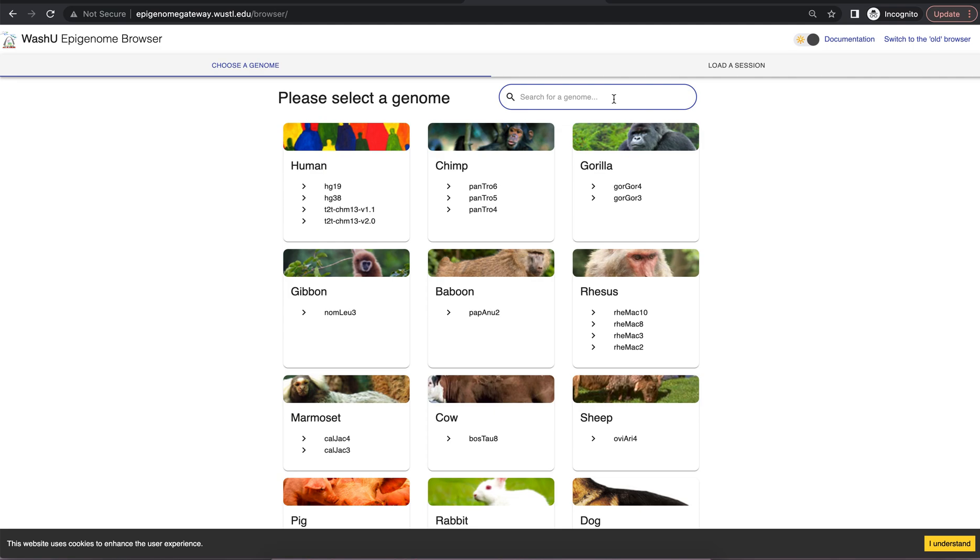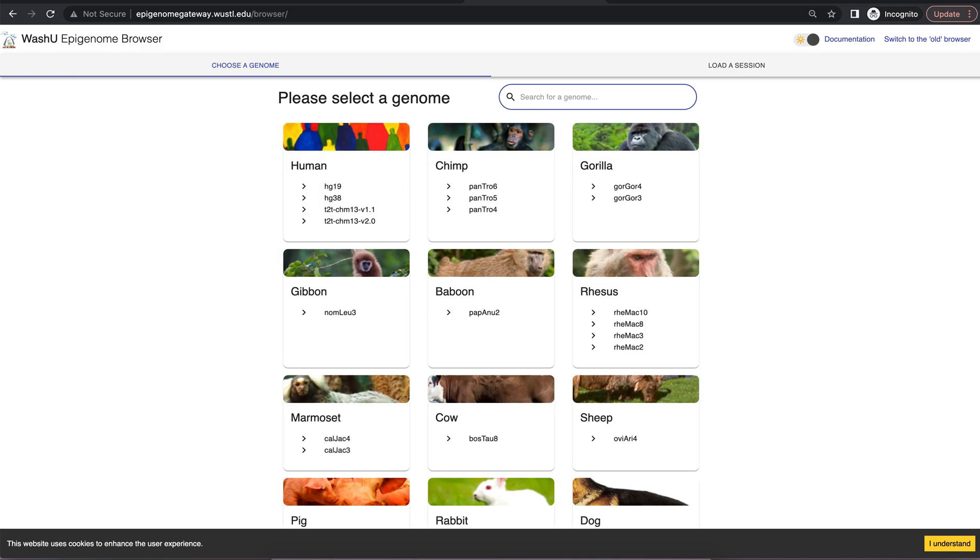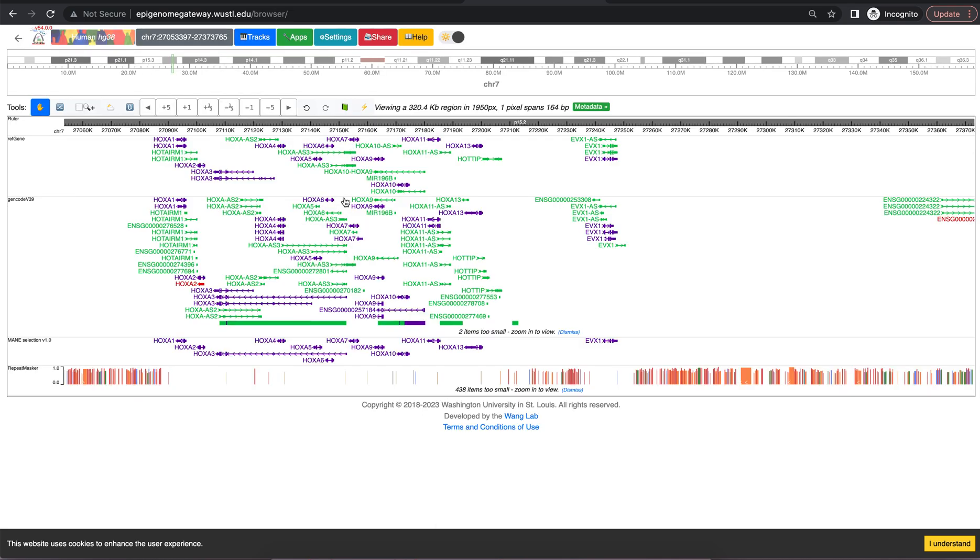To navigate to a specific species, type in that species into the reference bar and you can see the different assemblies here. For this tutorial we'll be using hg38.